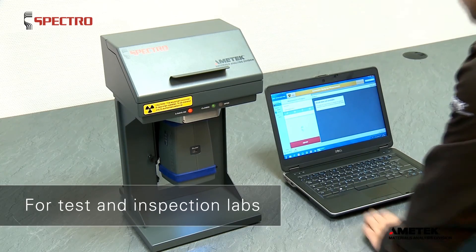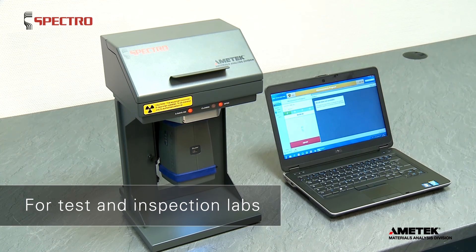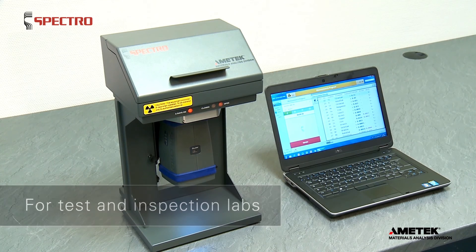XSort is an ideal solution for inspection companies and testing labs, offering models for every budget.